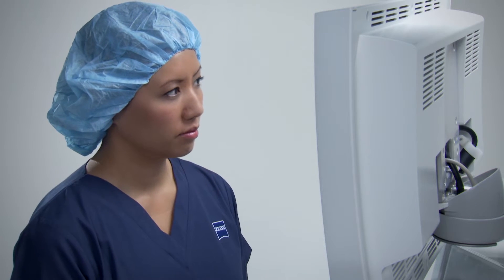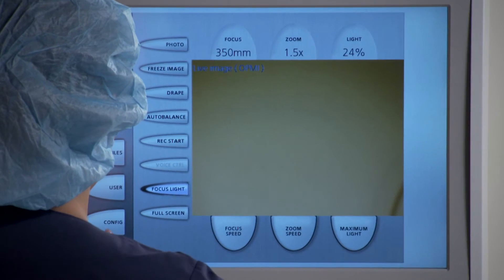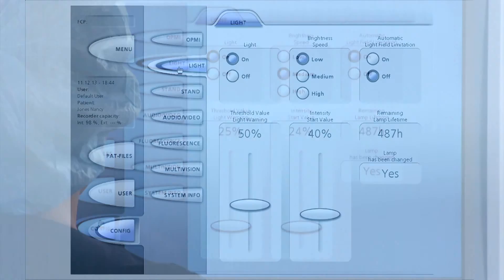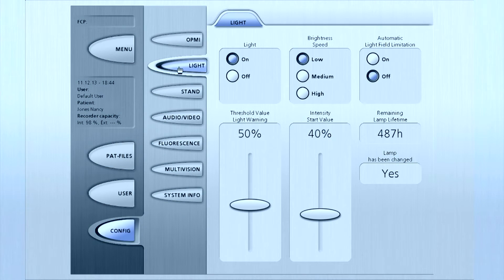To configure illumination using the light configuration menu, touch config at the bottom of the main menu and navigate to the light button.